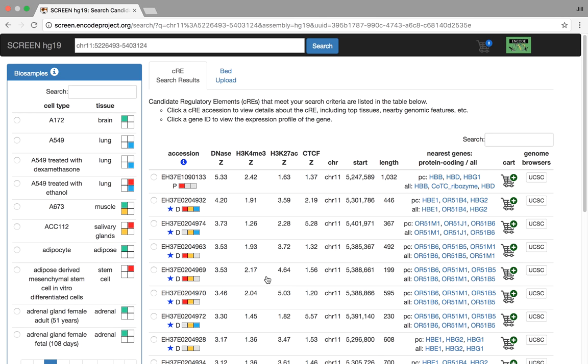Okay. There's a lot of things going on here, but let's focus on the most important thing. The most important thing here is this main table, which is actually the result of the search for CREs. So we put in the coordinate, chromosome 11, at this particular start and end of base pairs.